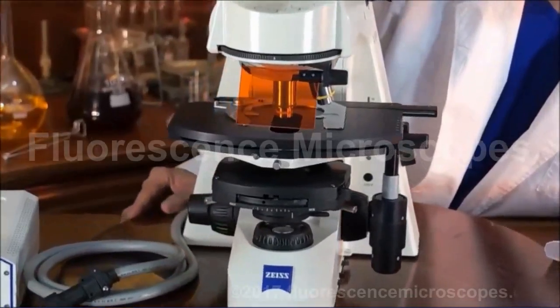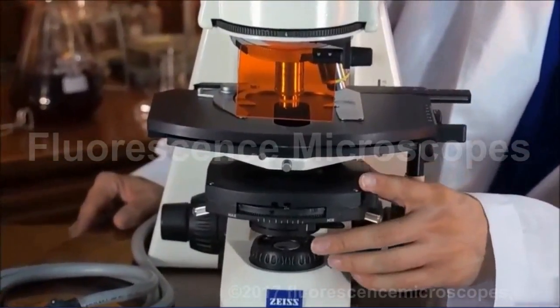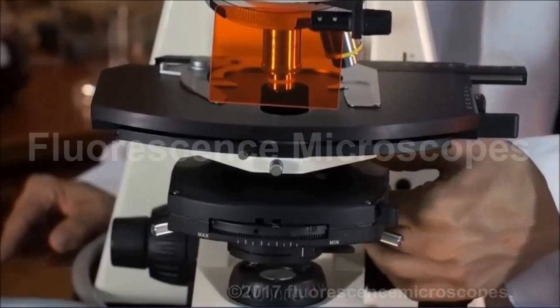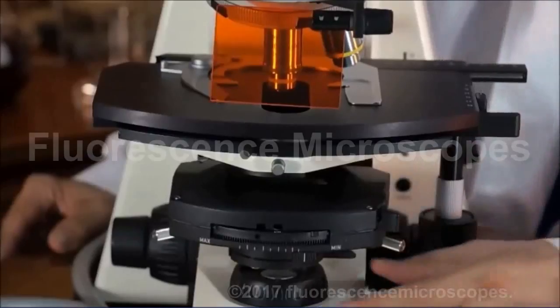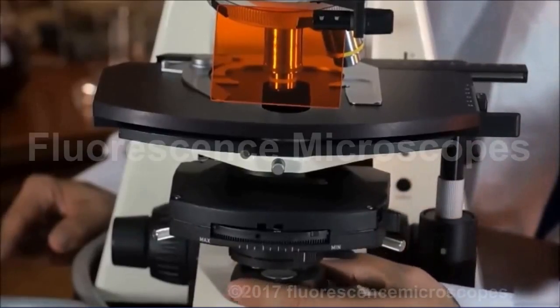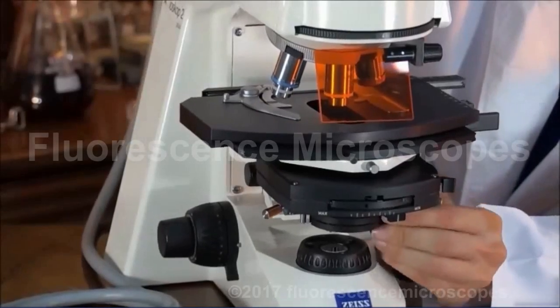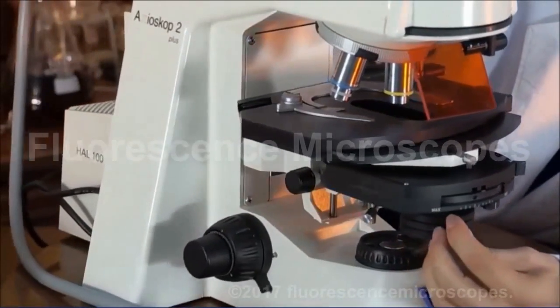Now we've got a universal condenser. This condenser, here's the rack and pinion for it. You've got a field iris diaphragm. This is what you're going to use for setting your Köhler. You've got filter holders on the bottom.